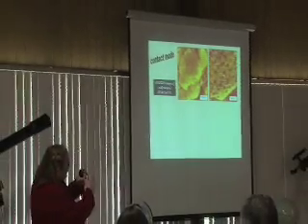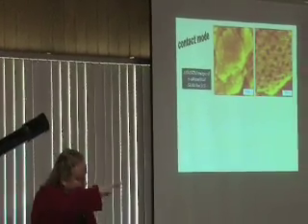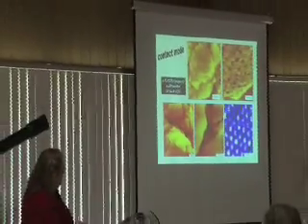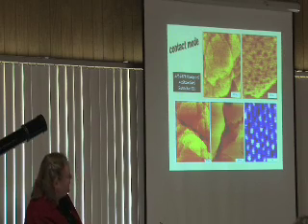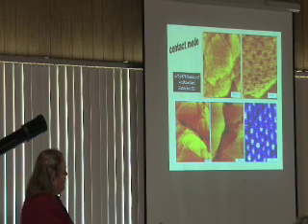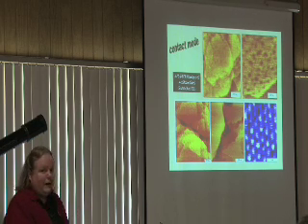They're little dark spots like Swiss cheese where the atoms are missing, and they're just missing a gold atom, so the molecules look a little bit shallower. Zooming in further and further, now you see the bright and dark spots. The bright spots represent where the methyl groups are. So even a molecular lattice, if it's organized, you can see it with an AFM. So that's my example of molecules.